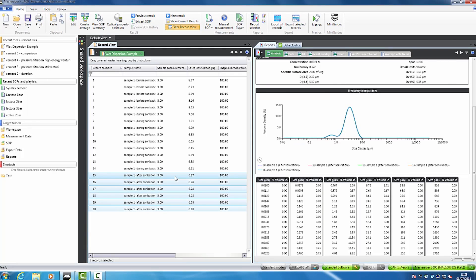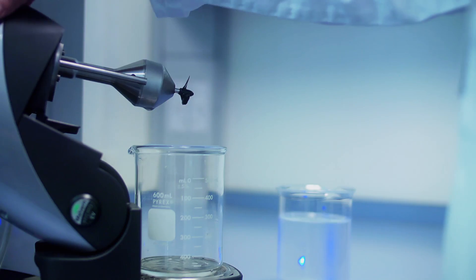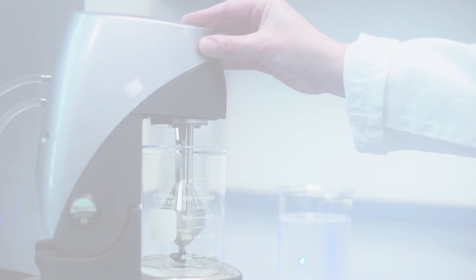Once stable measurements have been obtained, a clean sequence gets the system ready for the next measurement.